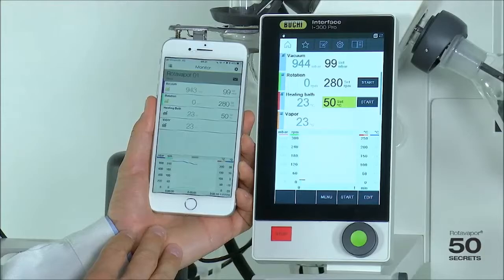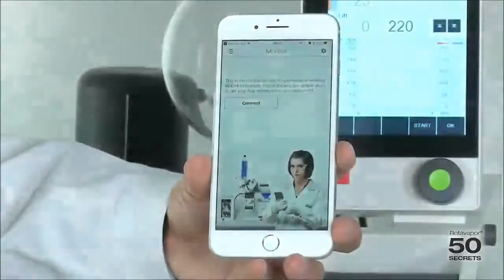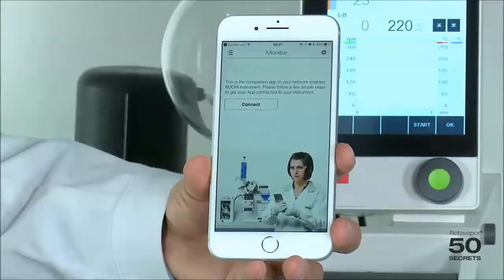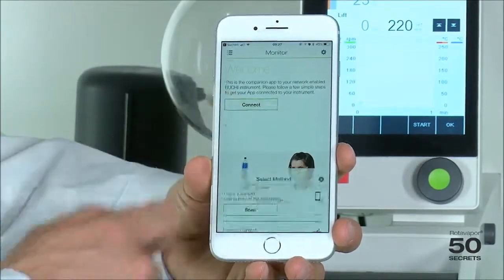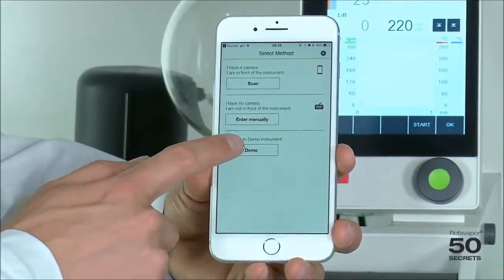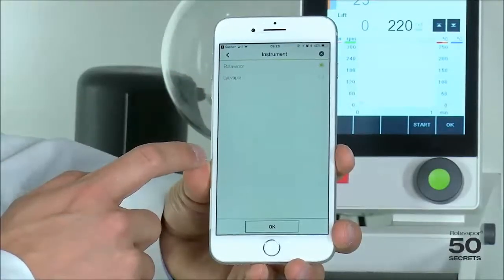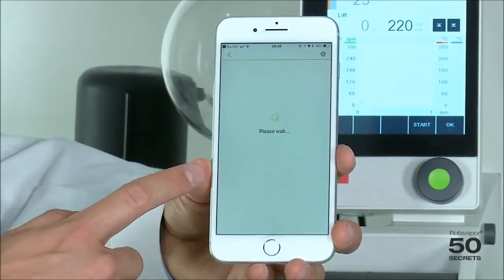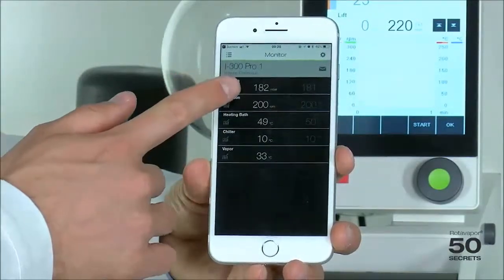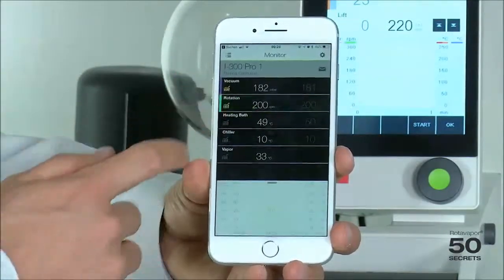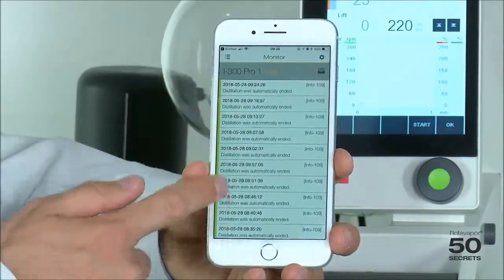This is especially useful when you talk about autodest. If you don't have a rotavapor or a liovapor at hand, you can simply connect to a demo instrument. You're then asked if it's a rotavapor or a liovapor — click OK, it's connected, and there you go. You have all the fields, the charts, and messages.